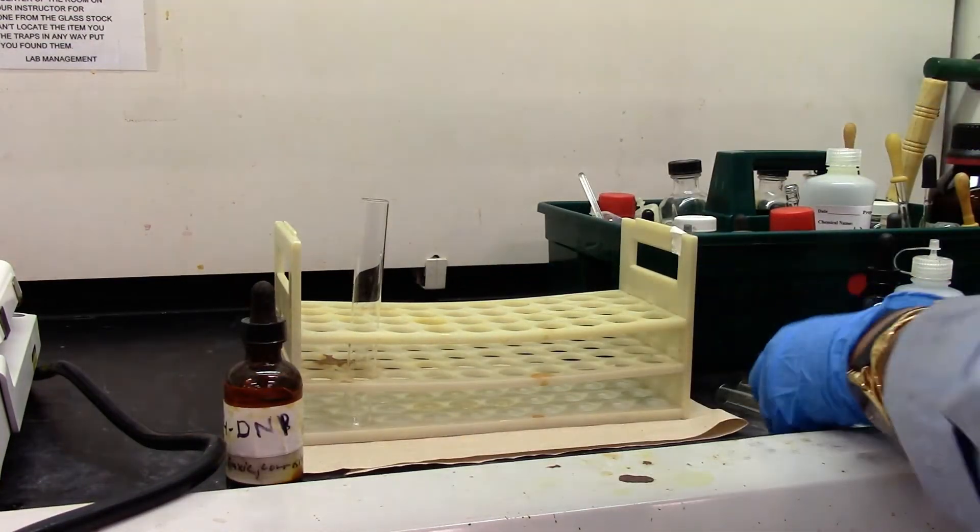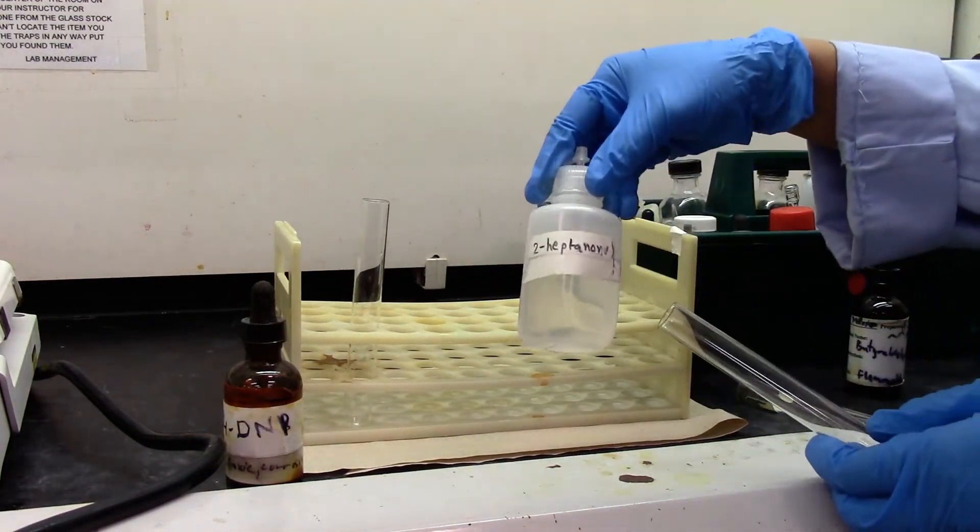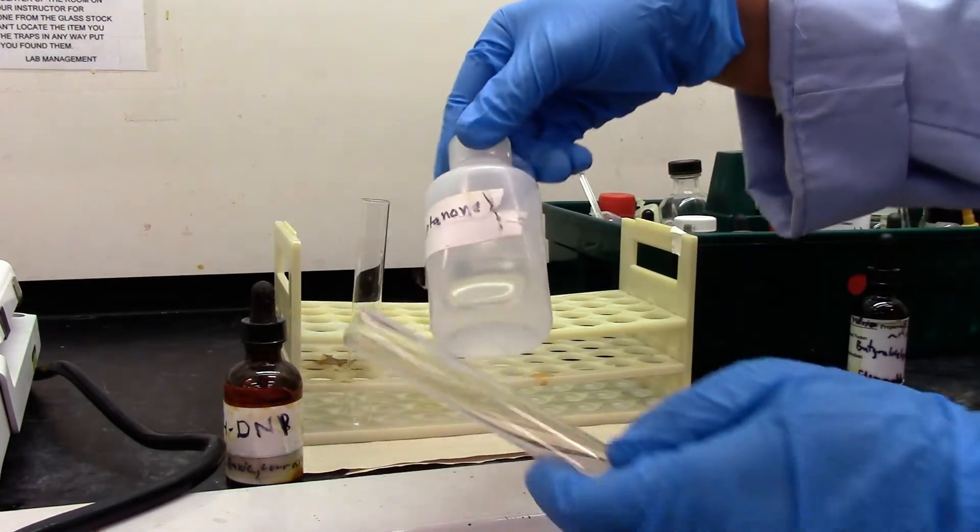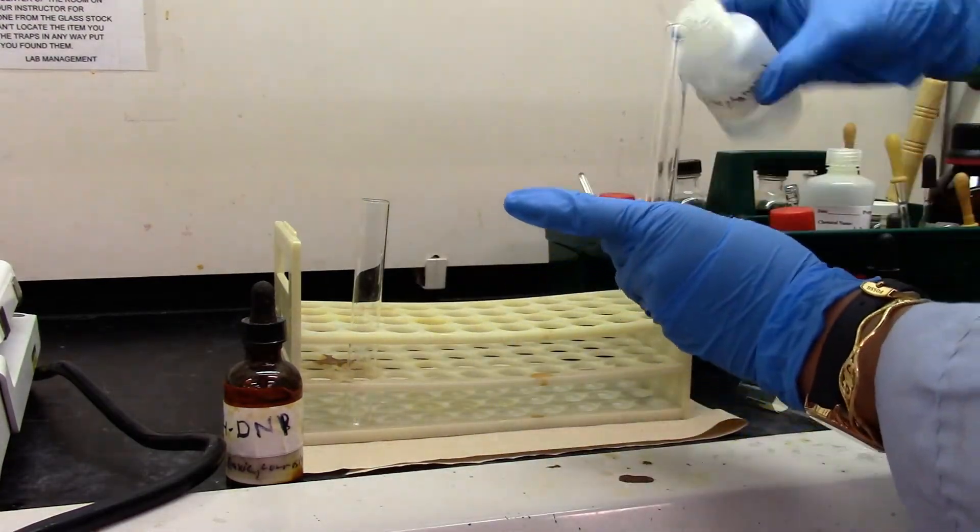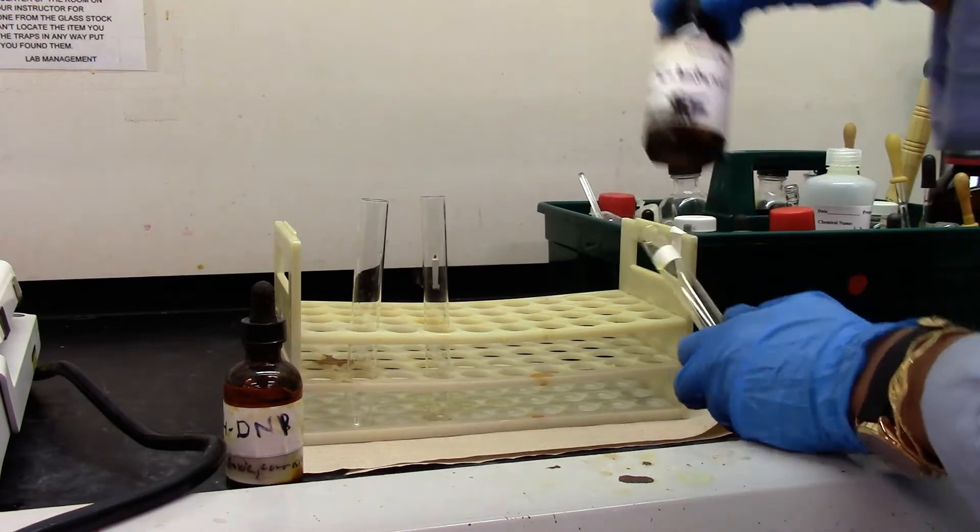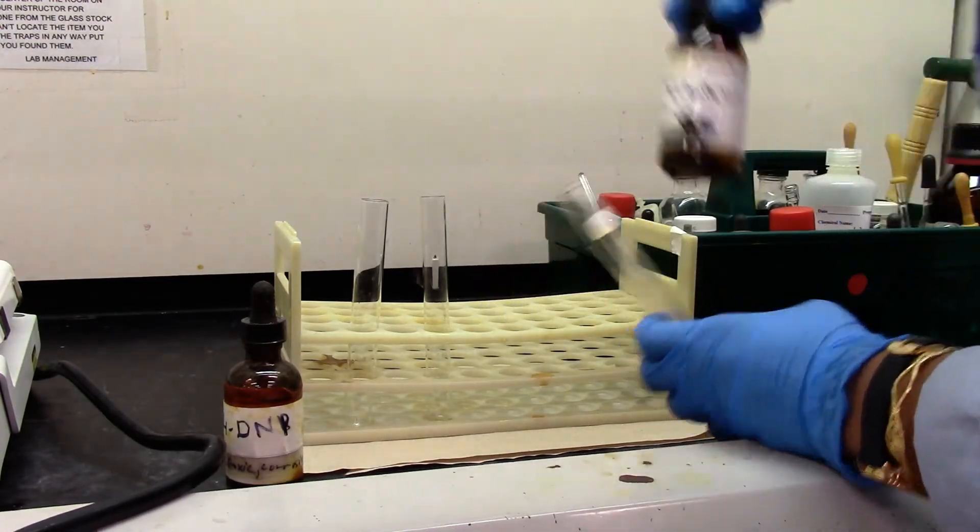That's my aldehyde sample. This is 2-heptanone, my ketone. For a negative test, I'm taking an alcohol, butanol.